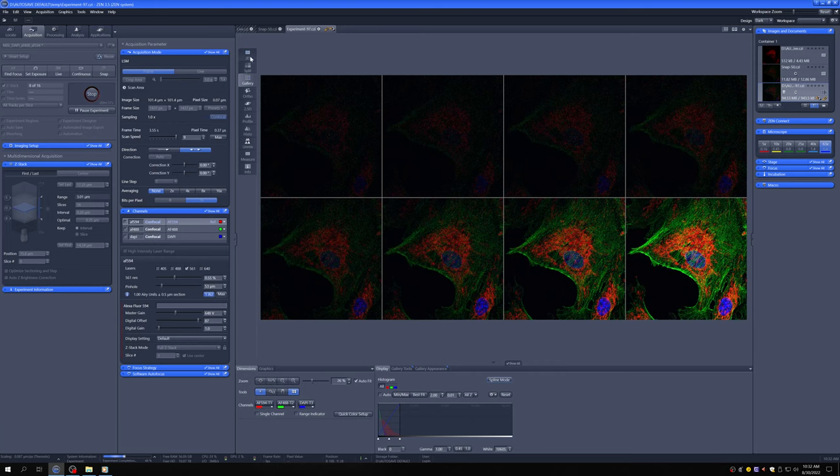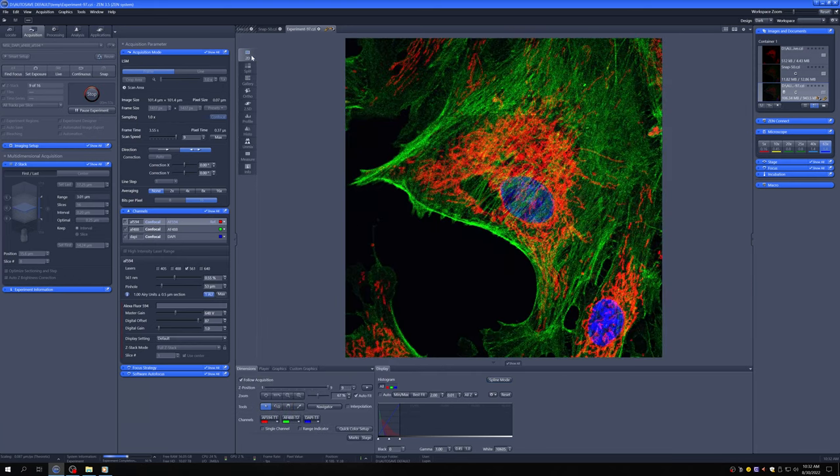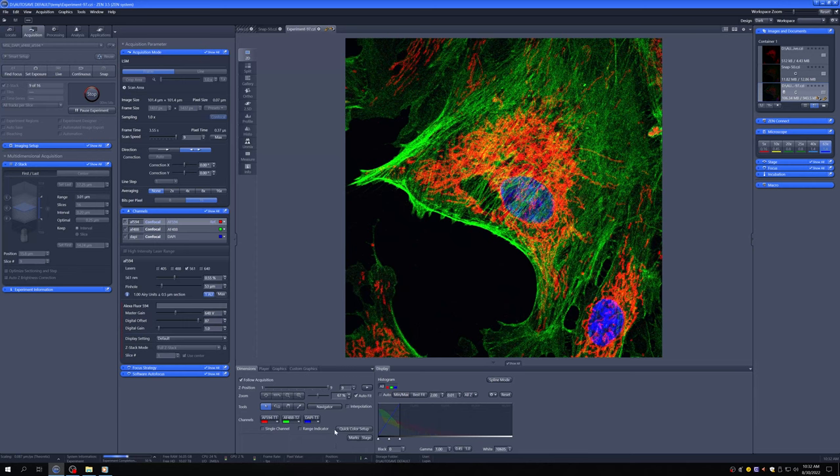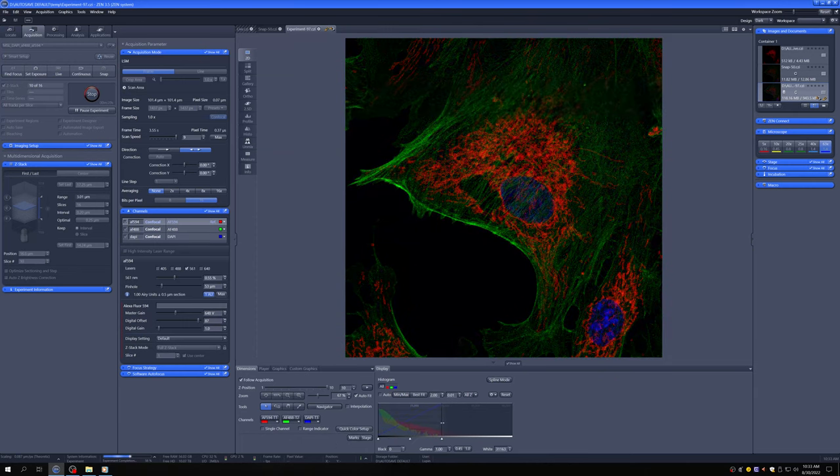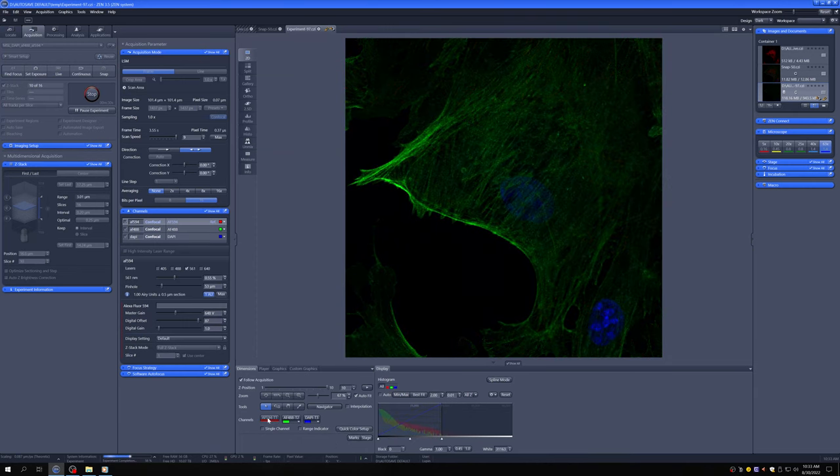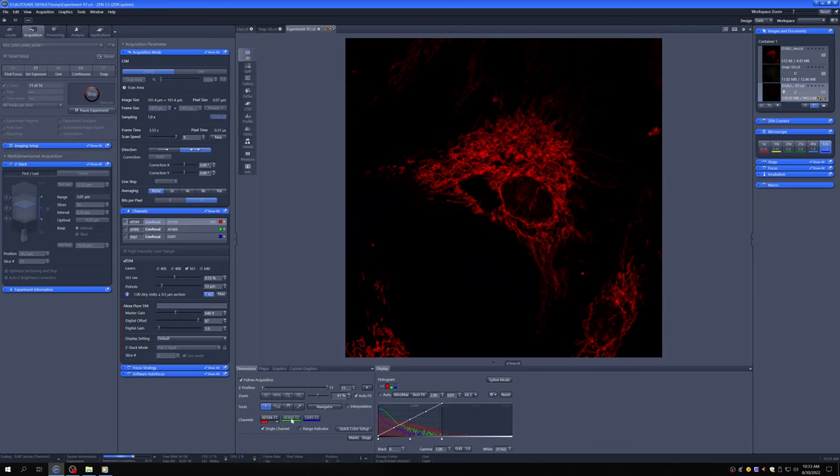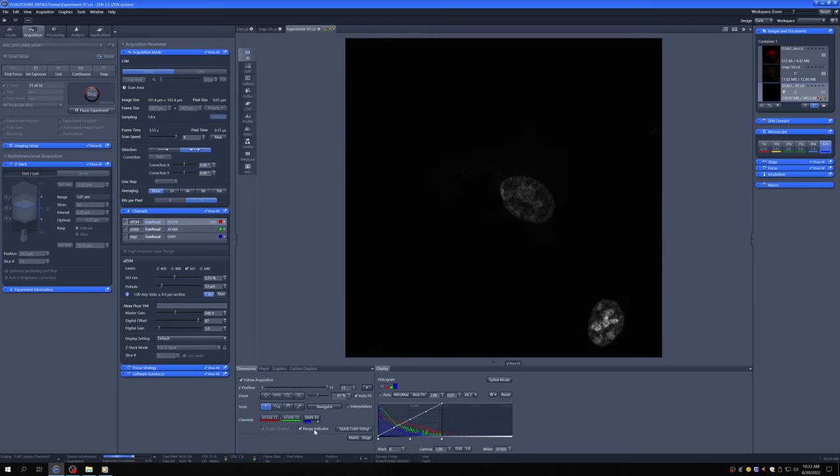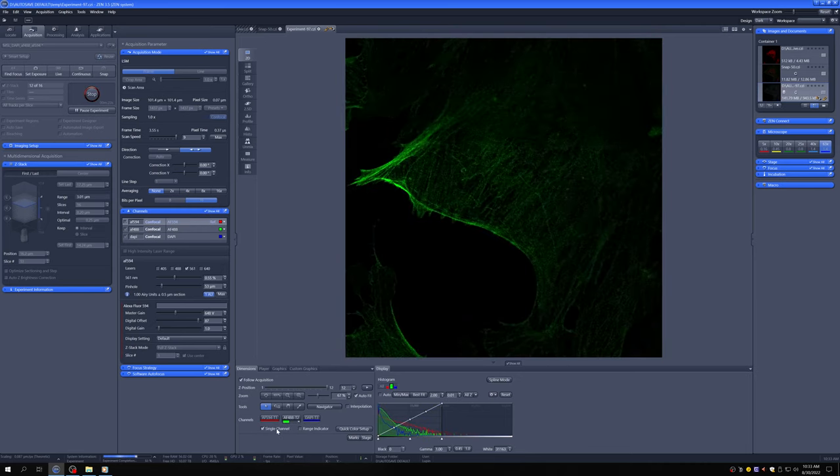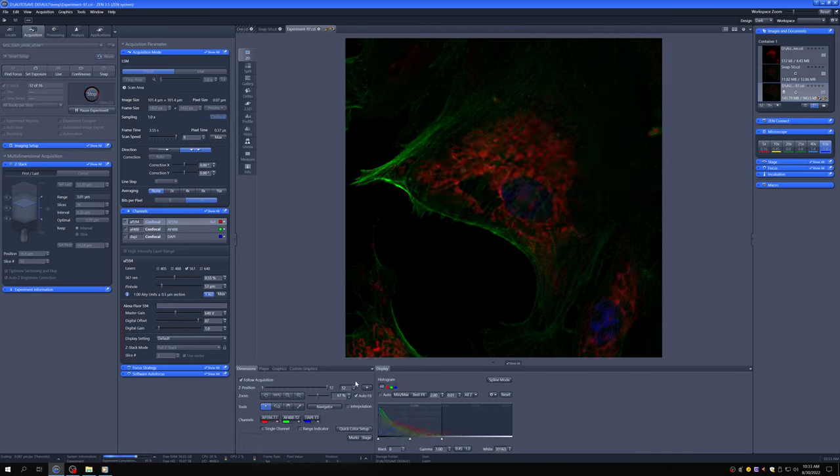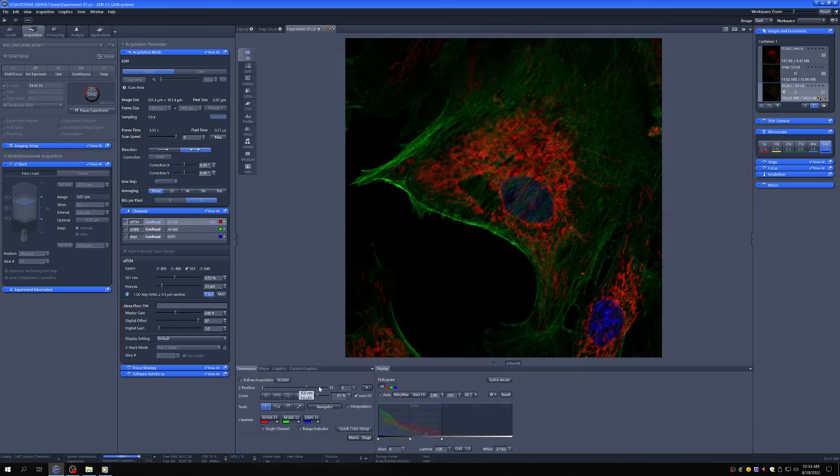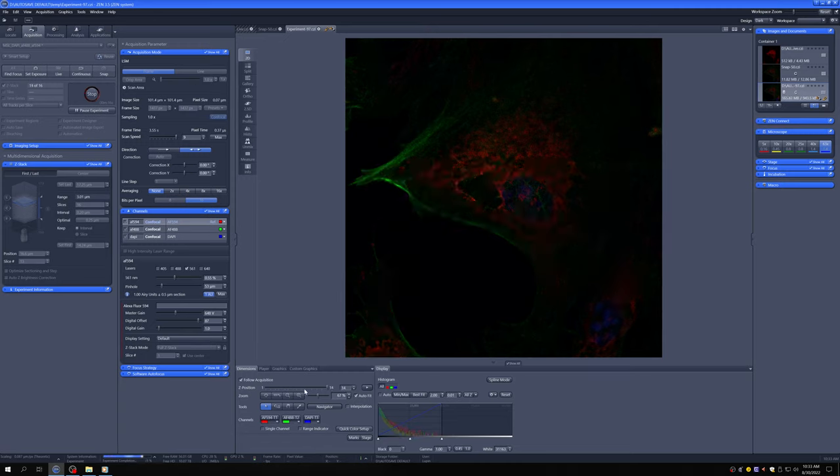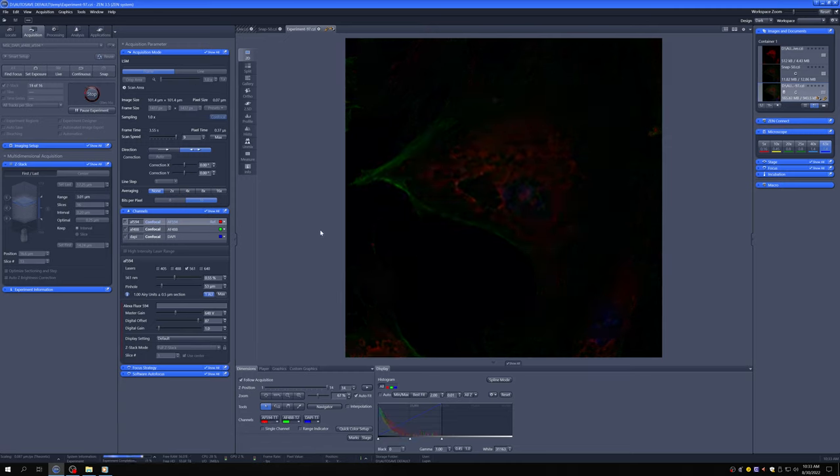So you can see all the channels here. You can turn channels on and off in the display here. You can select to go to a single channel, which you can have in range indicator mode if you want. There's various combinations of how you can look at things. You can look at different Z positions with this. You can click on Follow Acquisition for it to always show you the thing it's doing.